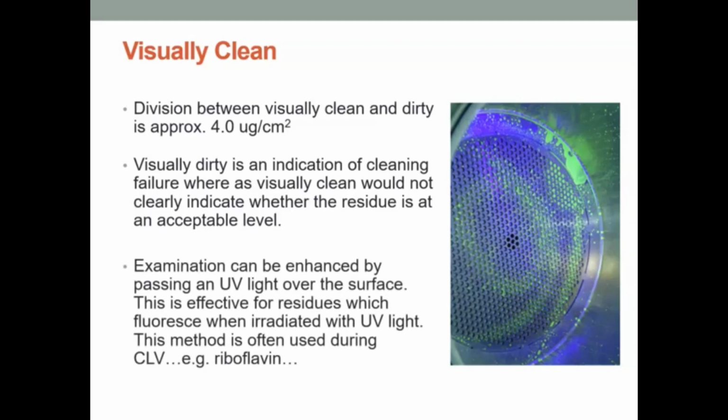Examination can be enhanced by passing a UV light over the surface. This is effective for residues which fluoresce when irradiated with UV light, and that method is often used during cleaning validation, like the riboflavin, which we already discussed.